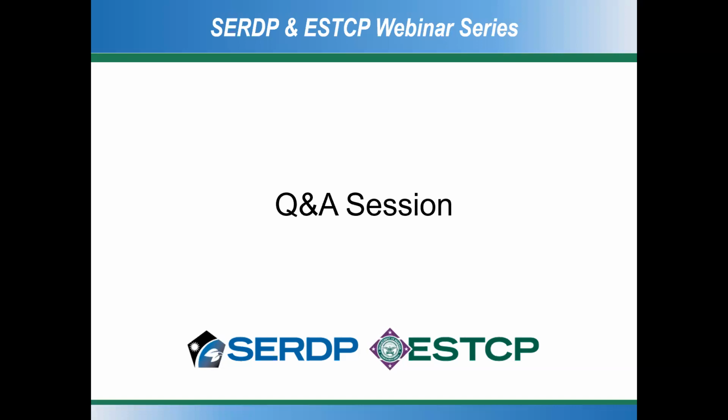And on the question for EPA, I have to operate a little bit with blinders because for hydrophobic contaminants, EPA did a lot of work to facilitate the inclusion and guidance documents for how to use passive samplers within EPA methods. That approach was very powerful and very useful and led to huge acceptance. We're not quite there yet with PFAS passive samplers.